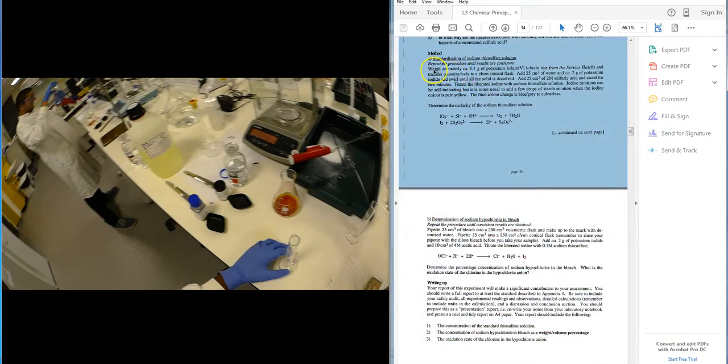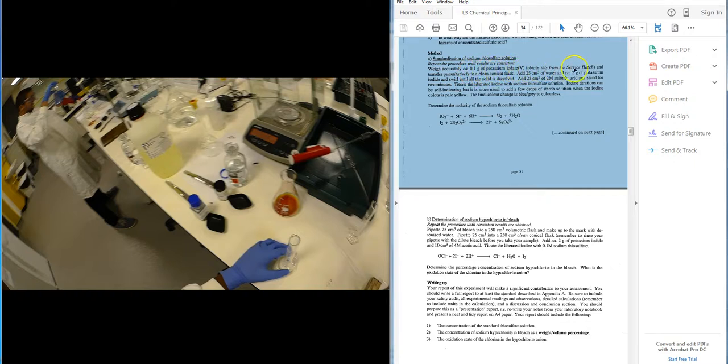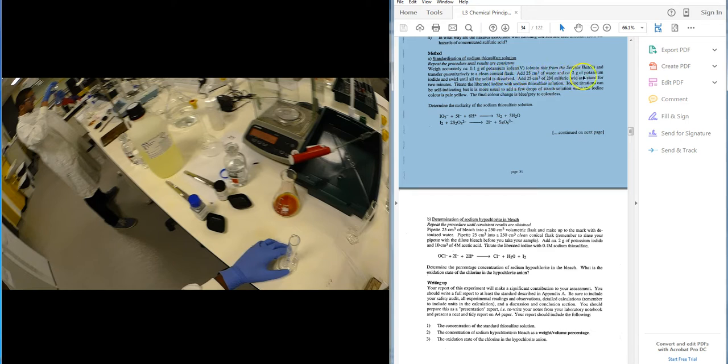So Part A, it asks you to weigh accurately about 0.1 grams of potassium iodate, which you will record, and transfer it quantitatively to a clean conical flask, and then add 25 ml of water and 2 grams approximately of potassium iodide. We've recorded the mass, and swirl until all the solids are dissolved.